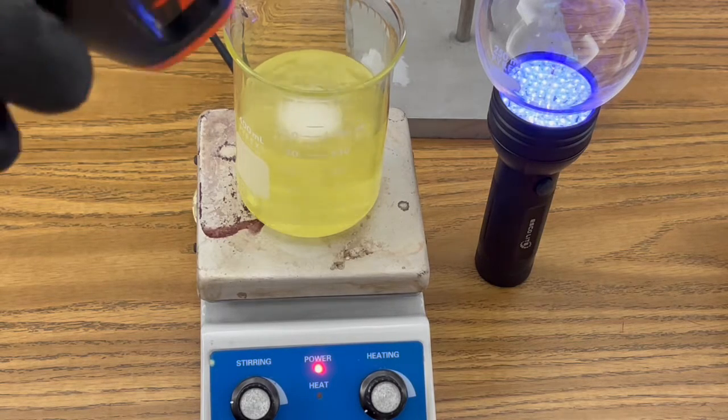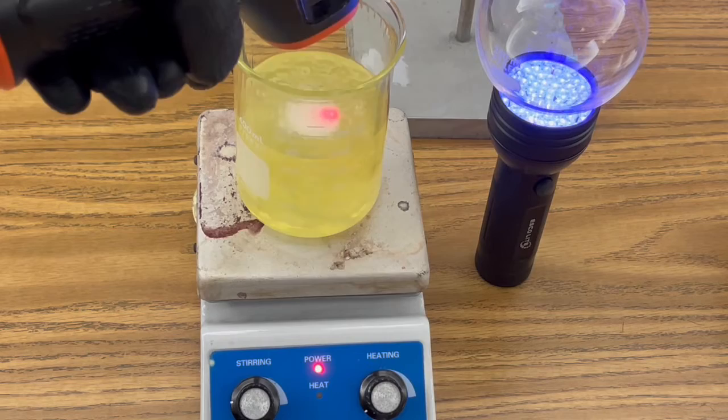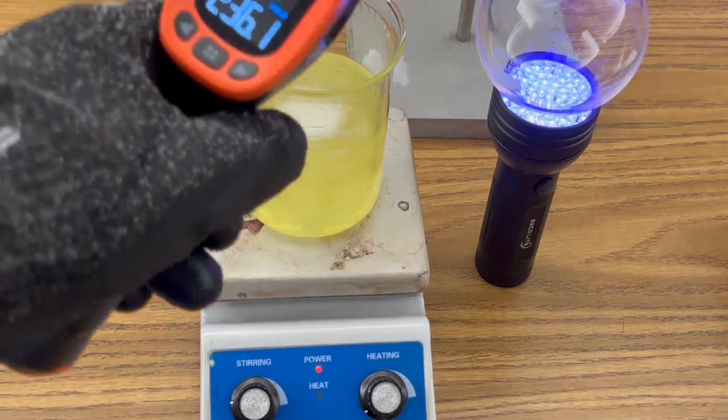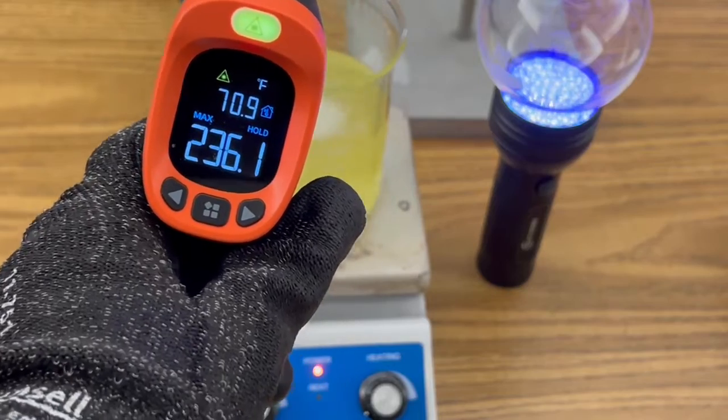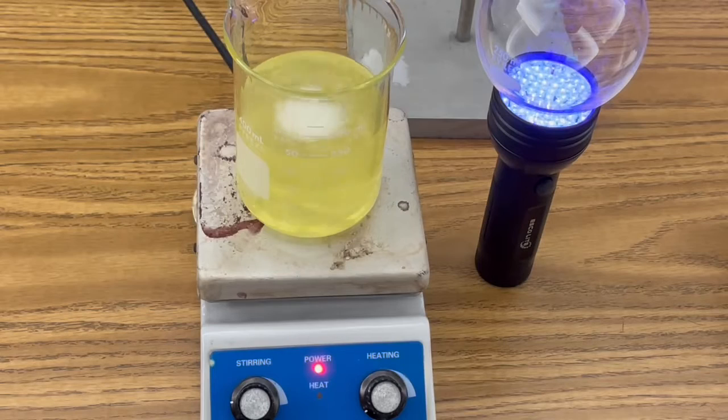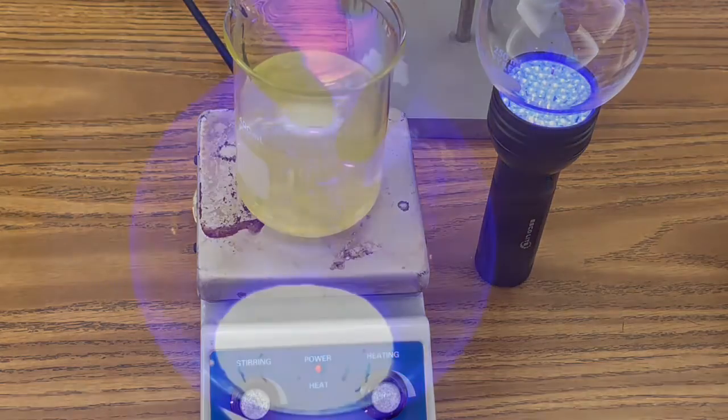Let's get a base temperature for that. Right now we're around 236 degrees Fahrenheit. And now we're going to add our solution to a round bottom flask and see if those sulfur crystals start to form.